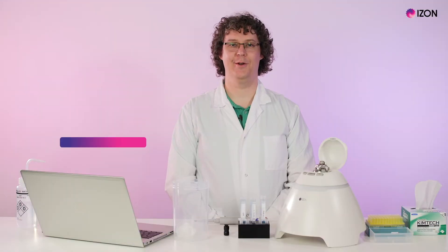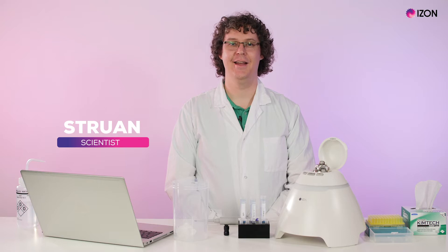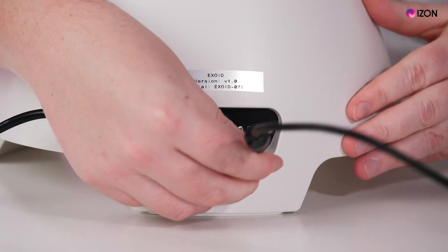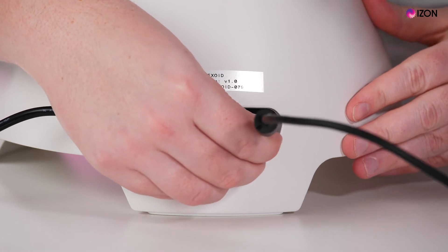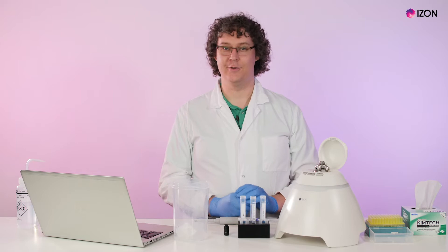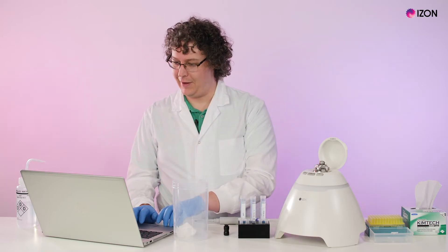Hello everyone, my name is Struan and I'm a scientist at Eyes on Science. Today I'll be walking you through how to set up a nanopore on your Exoid. First, check your Exoid is plugged in and connected to a computer, turn the power on, open the Exoid Control Suite software and wait for the Exoid to connect.